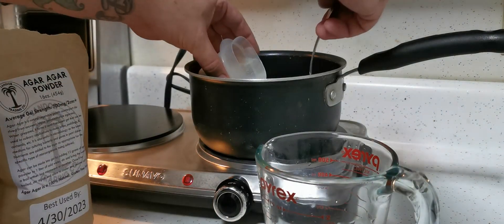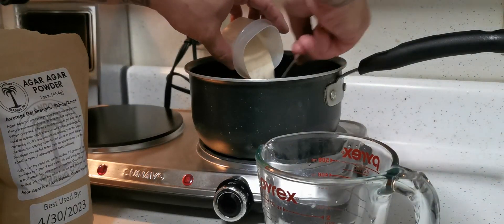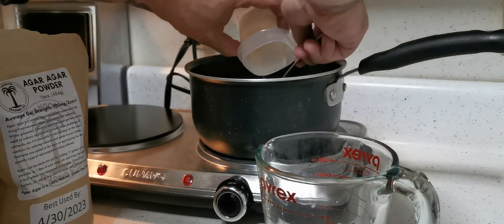We're going to add the ingredients to the water cold and stir them in. If the water is hot, the ingredients can clump up and it's harder to dissolve them.